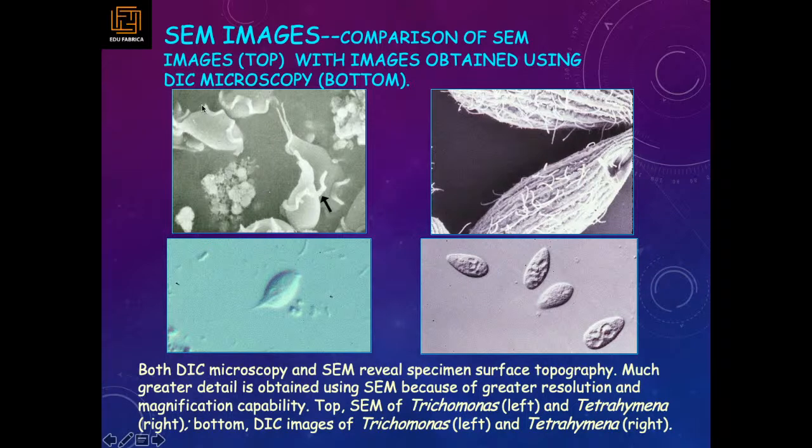The flagella are there in a flip-flop fashion, and on the other side Tetrahymena shows very nice 3D structures outside. In normal microscopy we can only see their morphology. This is a highly advanced technique, and whatever you are looking for, you can get the answers out of it.